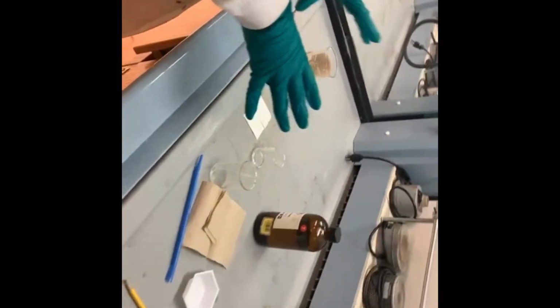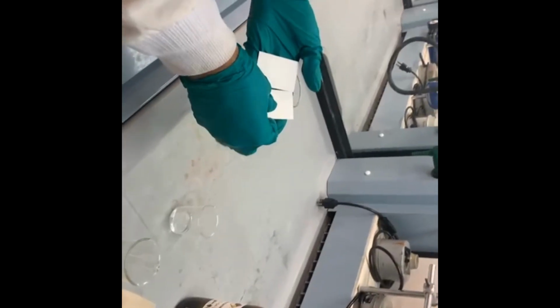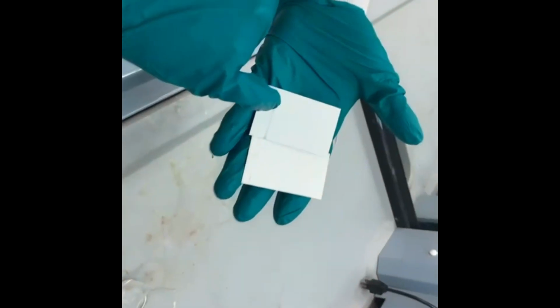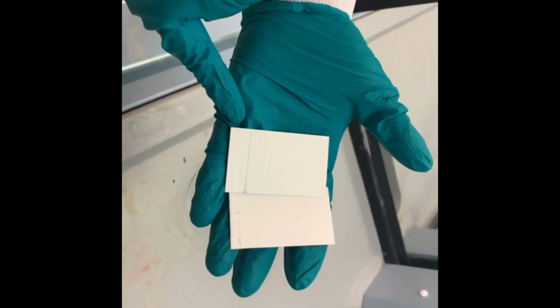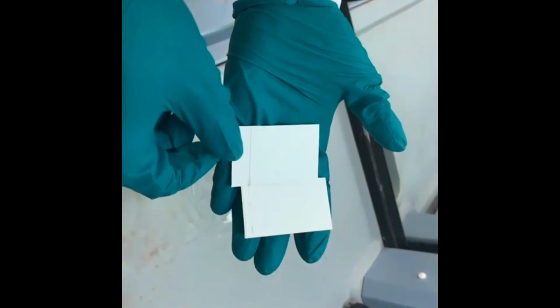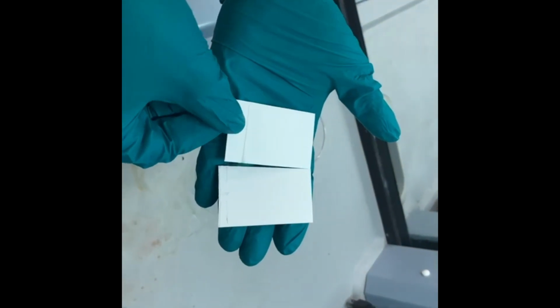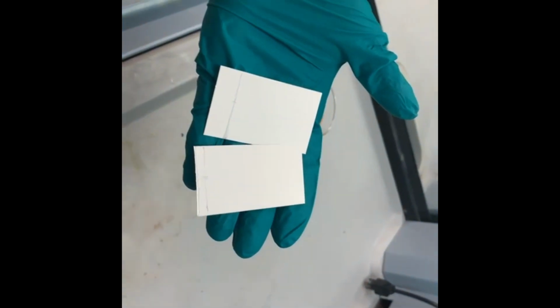Okay guys, so this is basically what you will need to perform a TLC. So these are the TLC plates. Normally you want to make sure that when you draw the line with the pencil that it's at least a quarter inch higher from the end, because when you put it in the chamber, if it's too low, your compound is just going to dissolve in the solvent system.